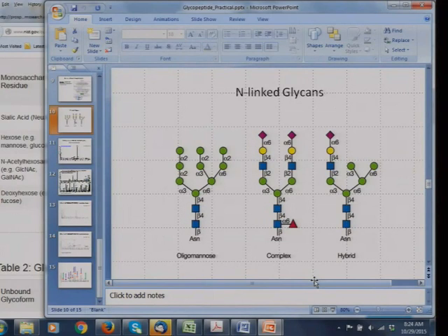There are possibilities with certain masses that you could get 2 different compositions. For this 1241, I don't think there is, but you could potentially come up with more than one composition that has the same mass.